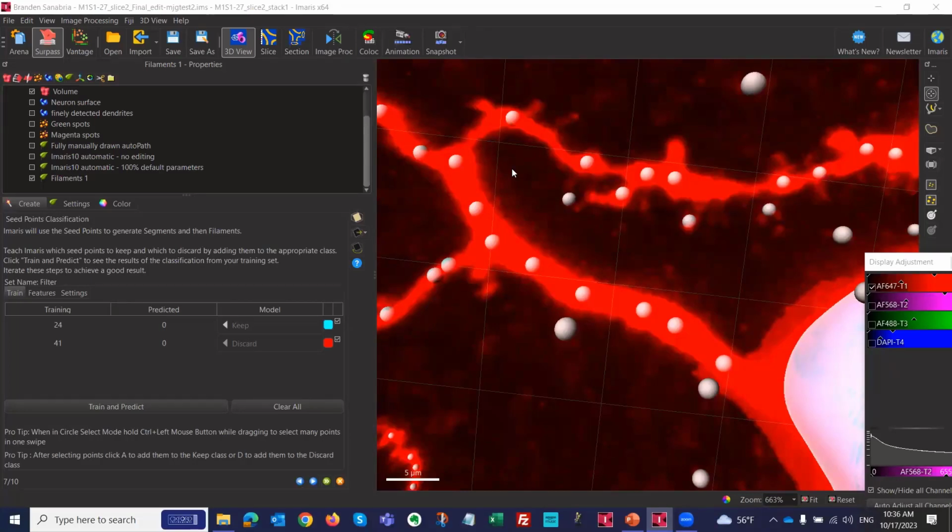Will it let you know if you've accidentally tried to keep something twice? Okay, so because you don't see it too much here, you can change the color to green, for example, like this, and now you can see those are the ones that I've selected. And even if you take this guy again here and you keep it again, it stays at 24.